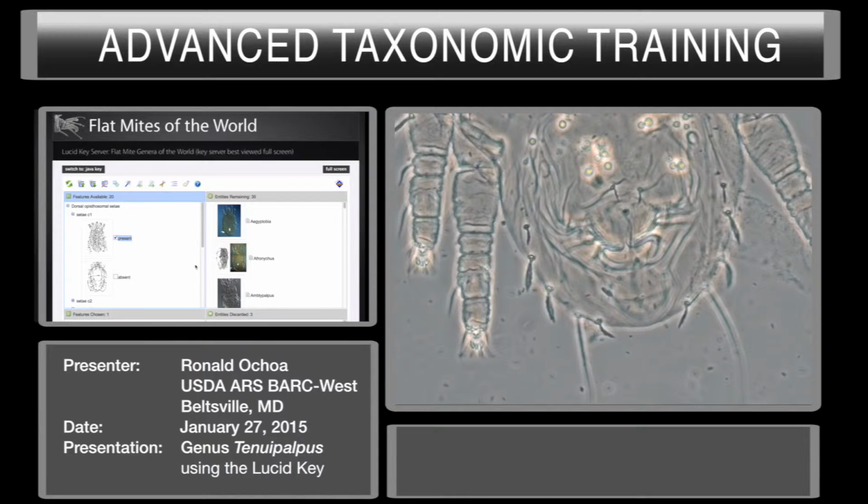C1 is present. C2 is present. No, C2 is absent. Nobody correct me here. Absent. D1 is present. D2 is absent.